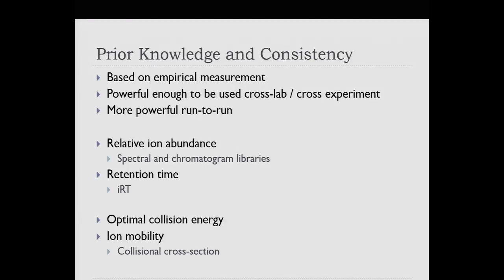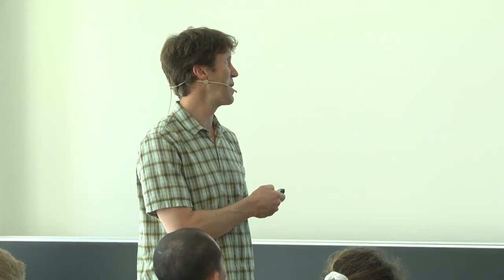So I wrote an article for the U.S. HUPO newsletter, and one of the sections was just becoming more familiar with what you're measuring, because I've seen people who spend a bunch of time on a set of targets, and by the time they're done, their confidence that they can measure what they're trying to measure goes up considerably.